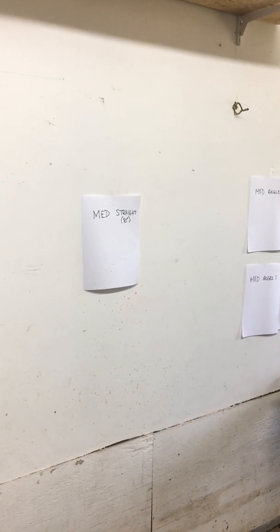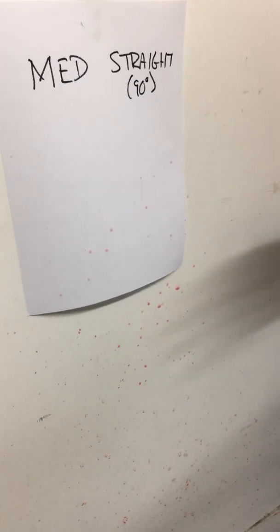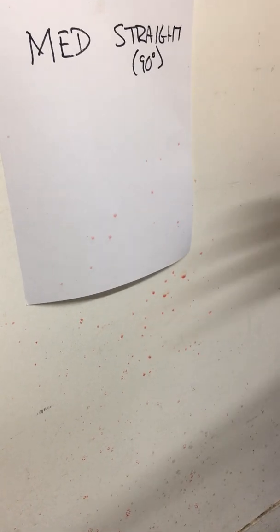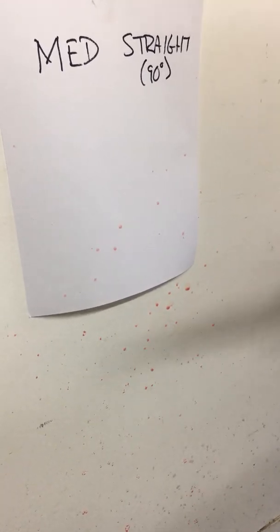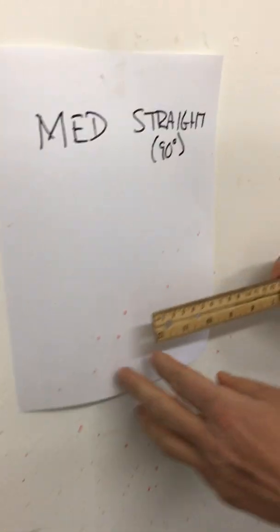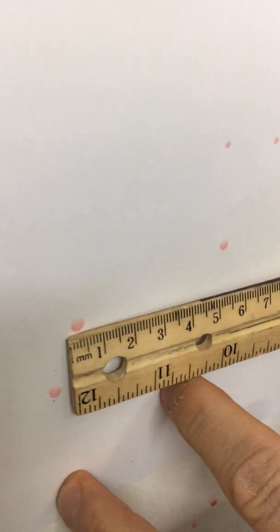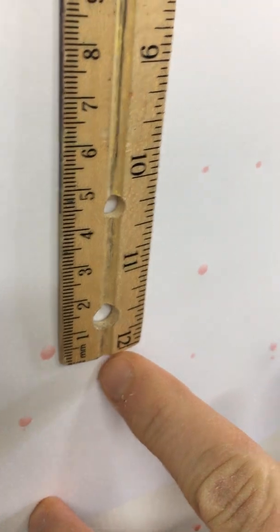All right, I missed the paper a little bit, but that's okay. Here we go. Let's take a look at 3 different dots. Now remember, we're looking at the size of the spatter marks compared to what we saw before. So I'm going to pick a couple, actually. Let's pick here. There's 1, width and length.